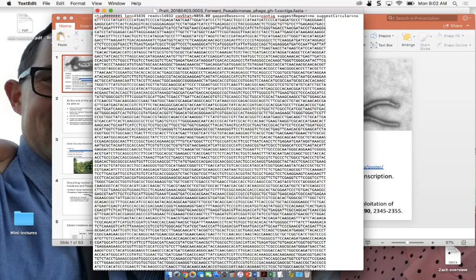One of the two that we got back is broken into 4 separate parts because they think that there are repeats in the sequence. You can analyze it if you want, but I'm not going to obligate you to. And the one thing that I will do is put the name that's associated with each one of these. You can analyze your own, or you can analyze a different one.